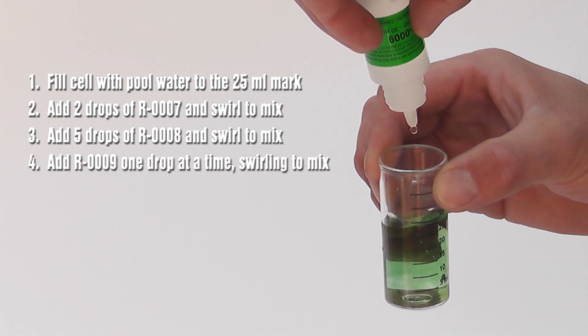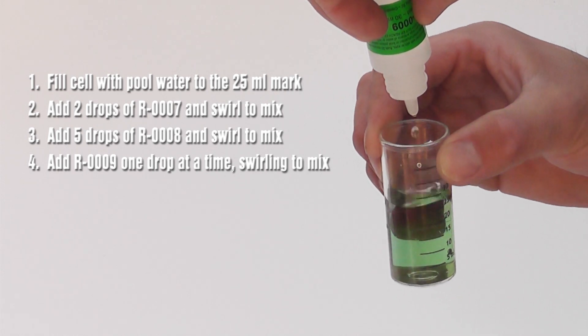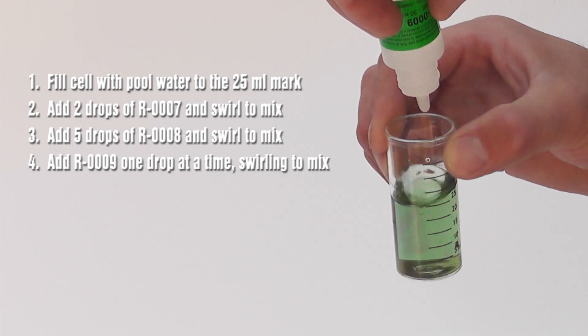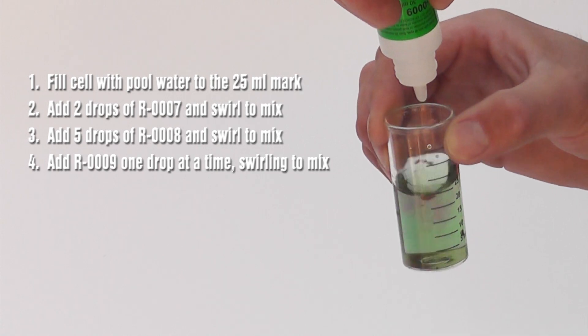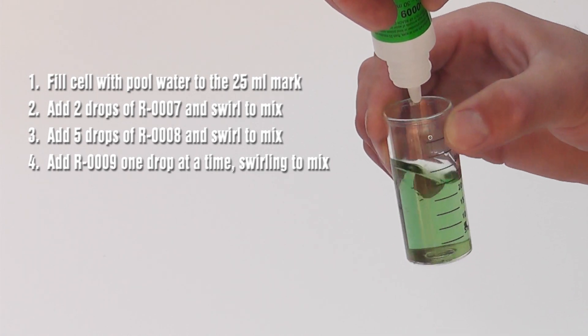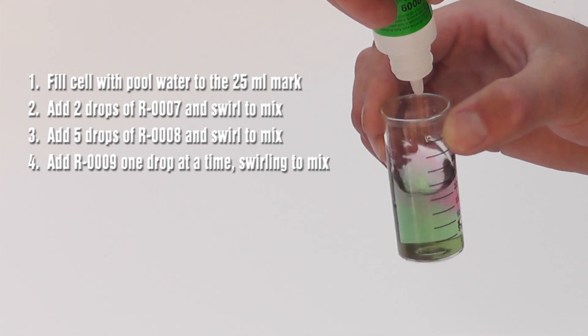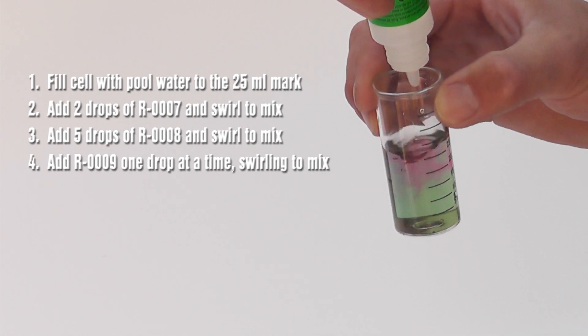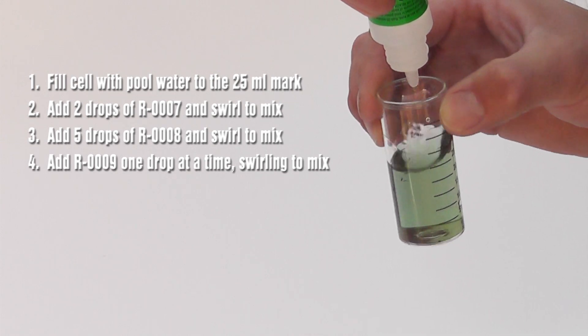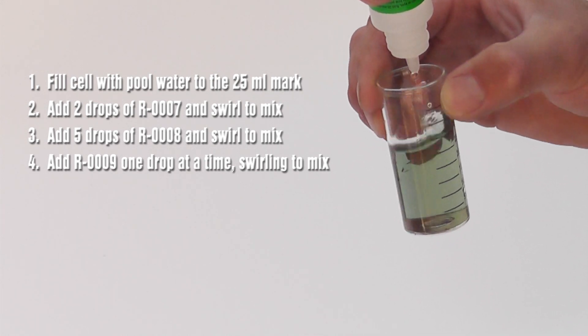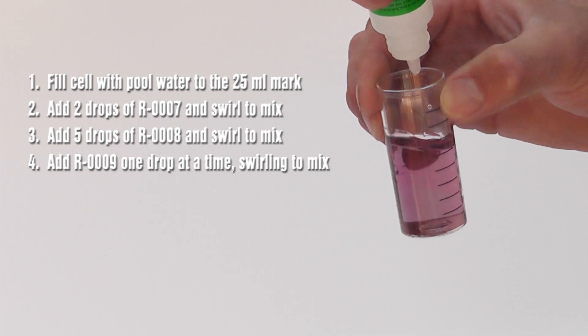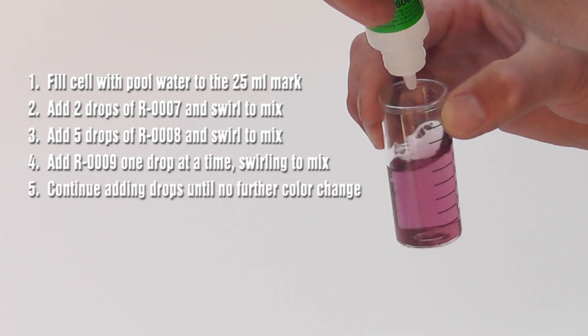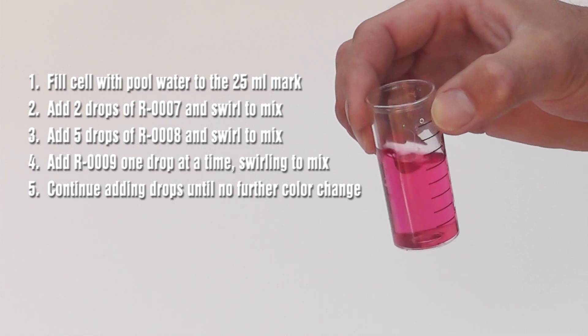Next, while constantly stirring, add R0009 one drop at a time. Continue adding R0009 one drop at a time until no further color change is observed.